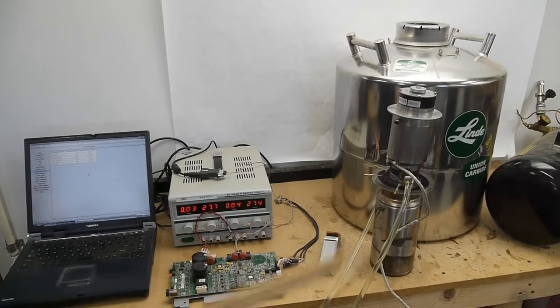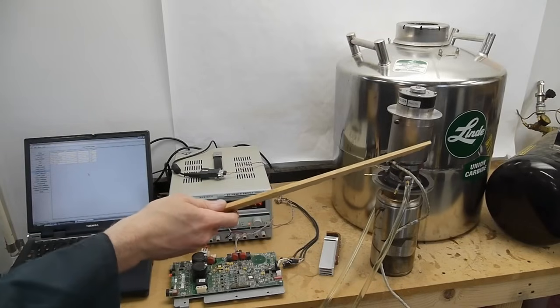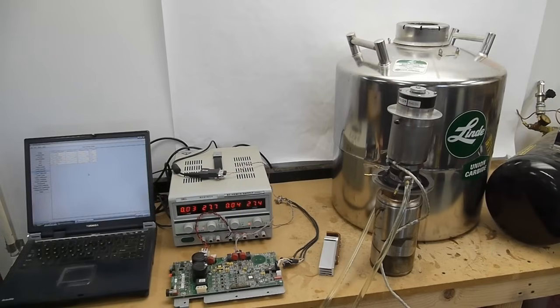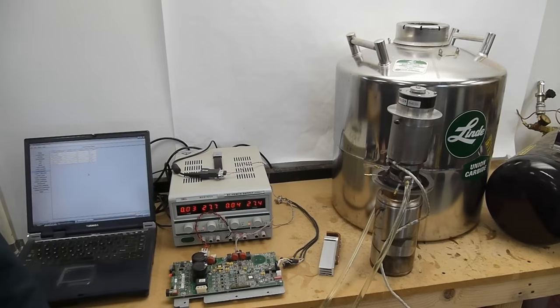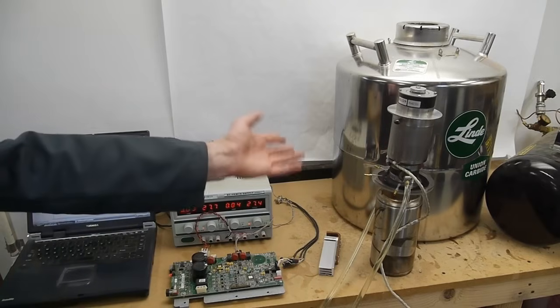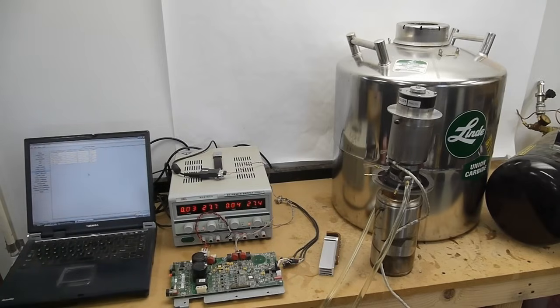The heart of the whole system is this Sterling cycle cryo cooler. Basically it's just a refrigerator that's designed to pump heat across a very high temperature differential. The tip of this device can get down to 75 degrees Kelvin and the rejection temperature can be about room temperature even a little bit above.